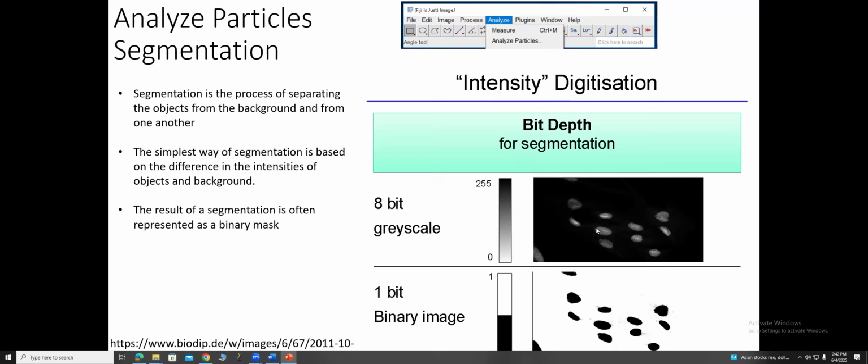So that's going to be 1. So now all of this that had many, many different shades of gray and different bit grayscale values, now it's going to have just one value, right? It's going to be just 255 or 0. That's it. There's no other option there. And this is a key to segment our image, okay?